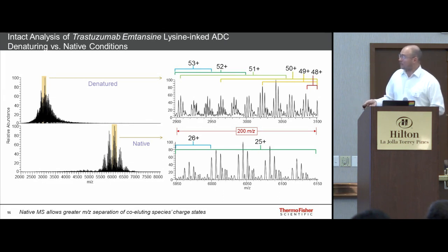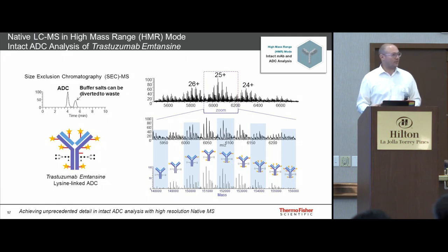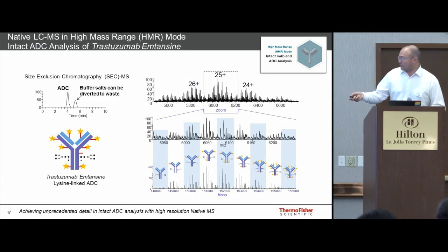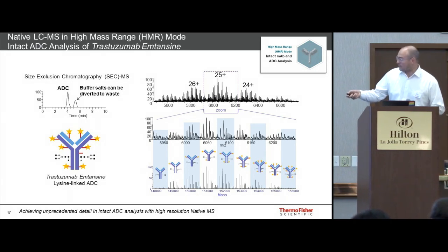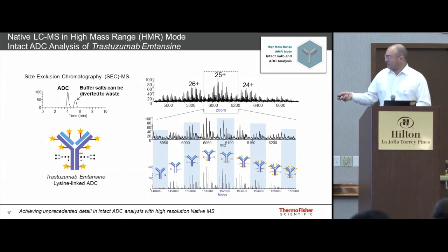For the analyst, this makes it incredibly easy to get a confident result. In this workflow, we generate a mass spectrum, and we can zoom in and see one of those charge states. All of this information comes from a single charge state cluster at the plus 25. So there's literally hundreds of things in this tube, in this sample mixture.